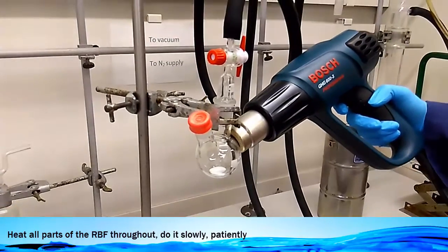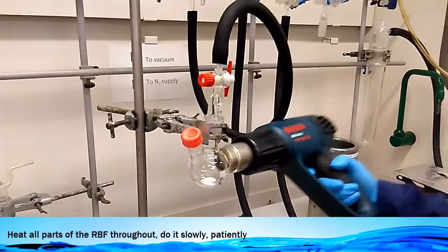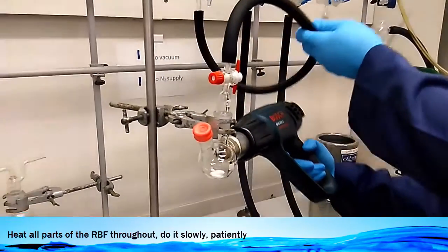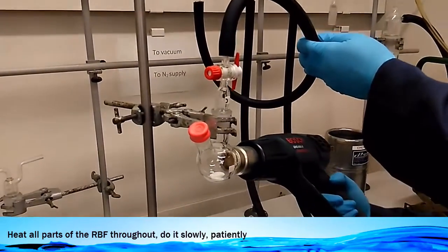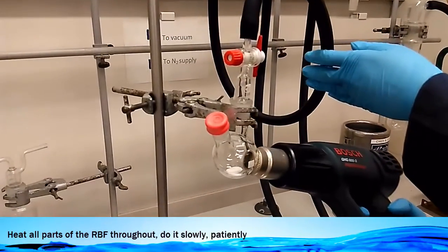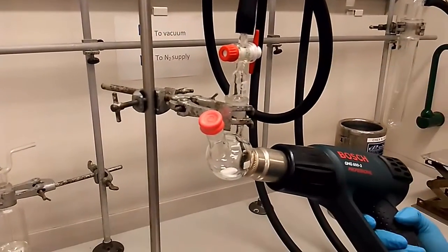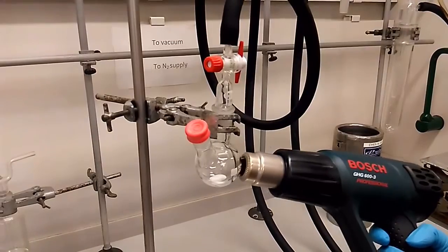Do not swiftly rotate it too fast and move it around the round bottom flask. Slowly, carefully, make sure that every single part of it has been heated with the hot air gun.